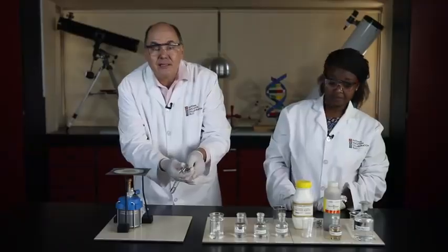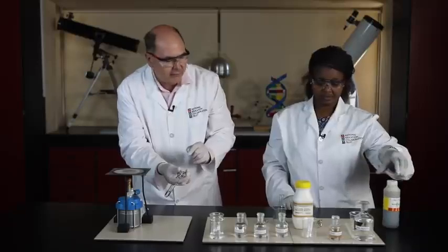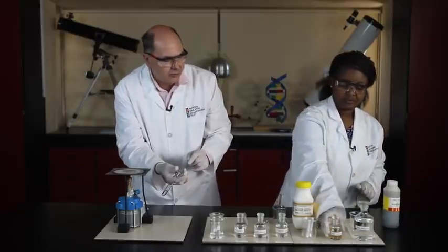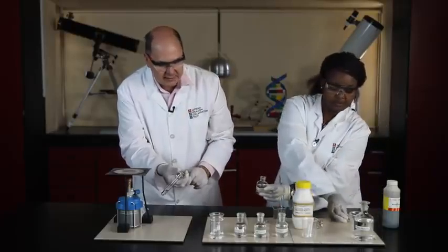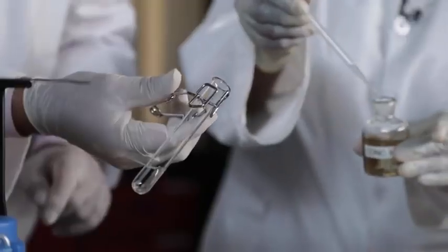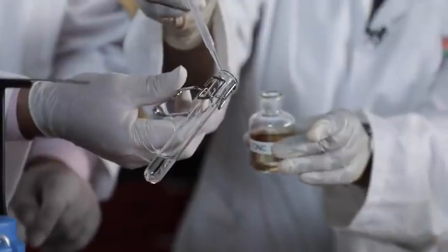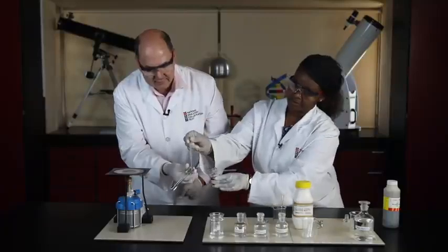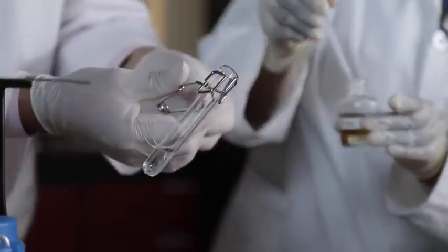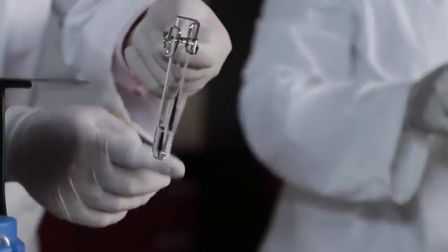We need to add our catalyst. The catalyst is concentrated sulfuric acid. So we need to work very carefully now. So only 2 or 3 drops of concentrated sulfuric acid. We're going to run it down the side of the test tube, and hopefully that will get the reaction going. There it's sliding down. It's 1 drop. Lovely. Swirl it. It doesn't look like much is happening, but this mixture is starting to get hot.